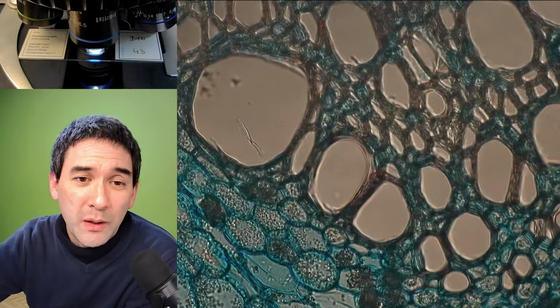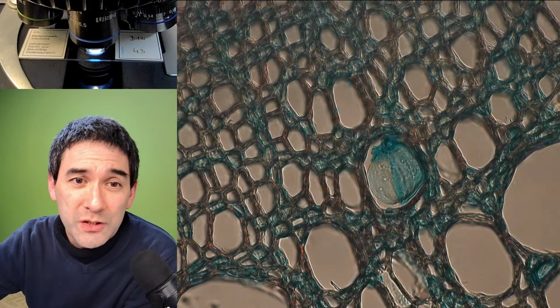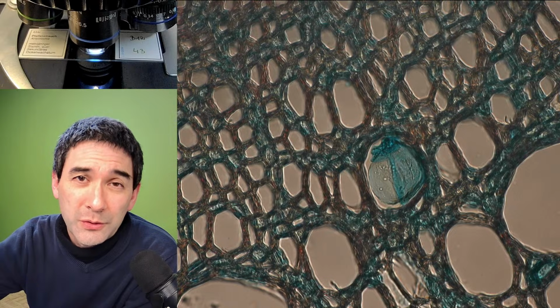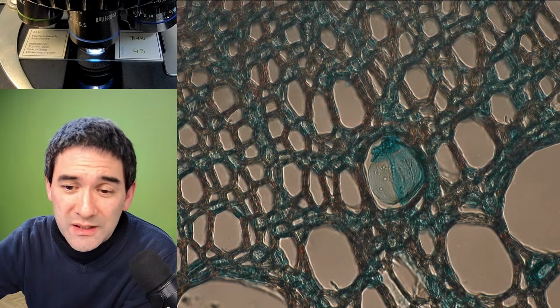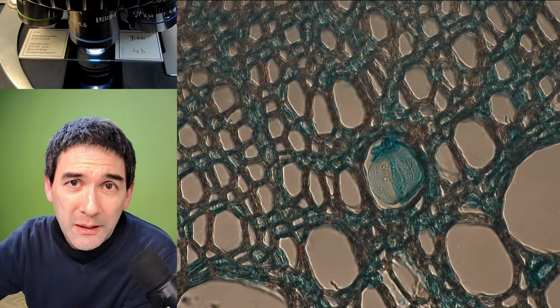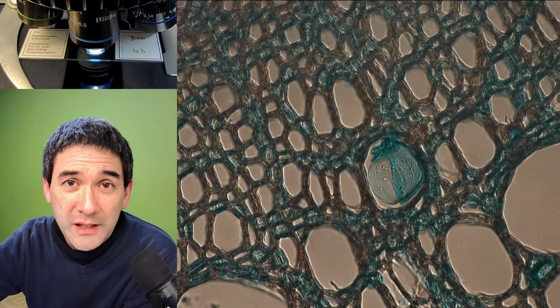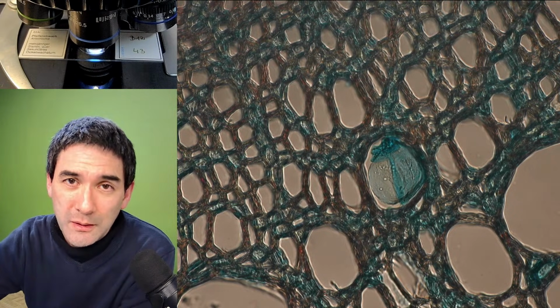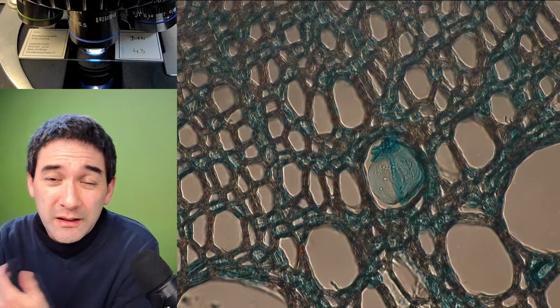What can happen, and I've mentioned this already several times before, is when people are not careful with their oil immersion procedure. This can actually be a problem because sometimes people rotate their non-oil immersion objective, like the 40 times objective, into immersion oil. You shouldn't do that. Then you have to clean it, right?